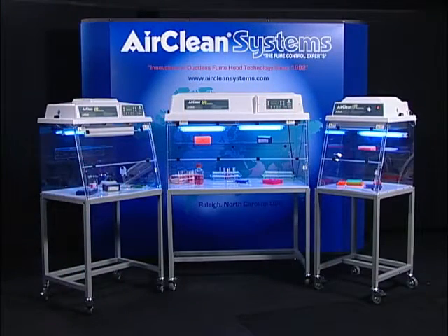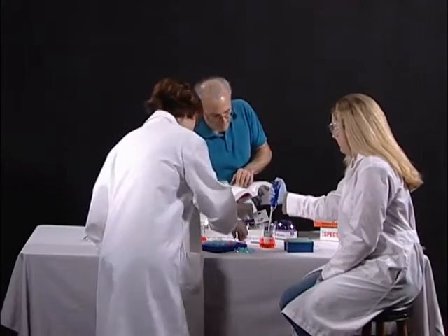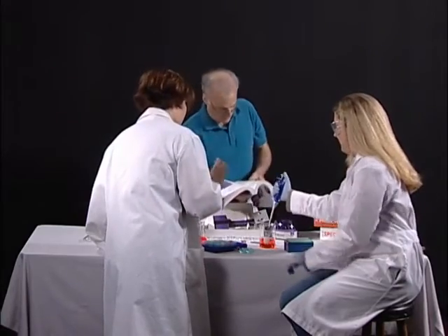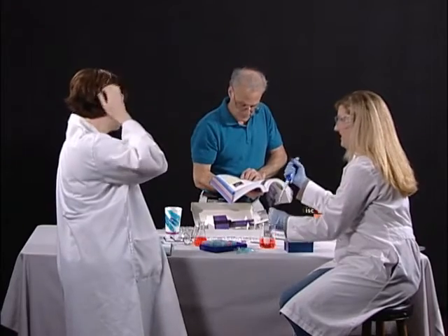AirClean Systems PCR workstations are designed as application solutions for the manipulation and amplification of DNA and RNA. Cross-contamination during amplification of DNA and RNA can lead to inaccurate results, costing the lab technician valuable time and consuming expensive reagents.